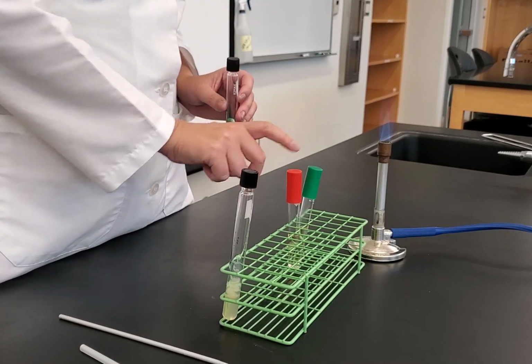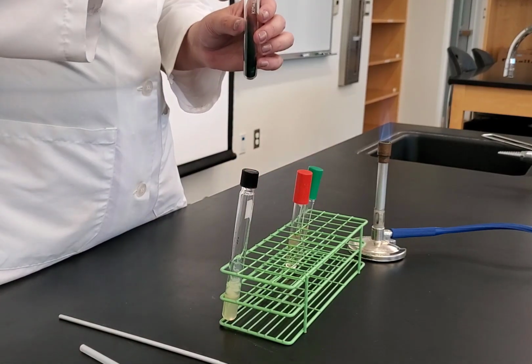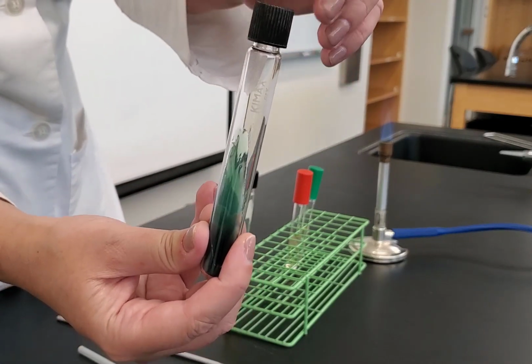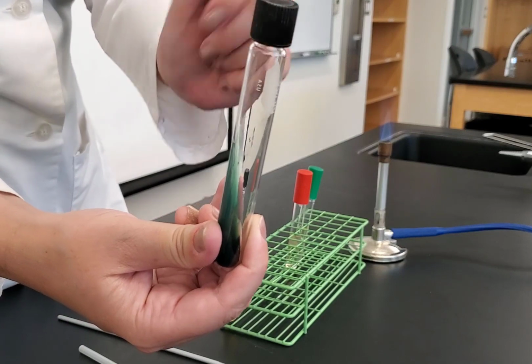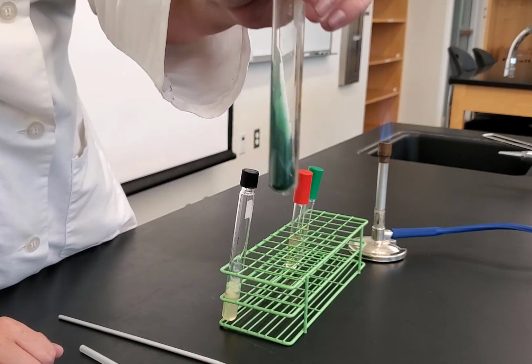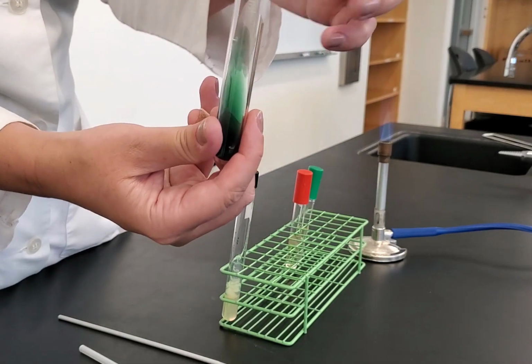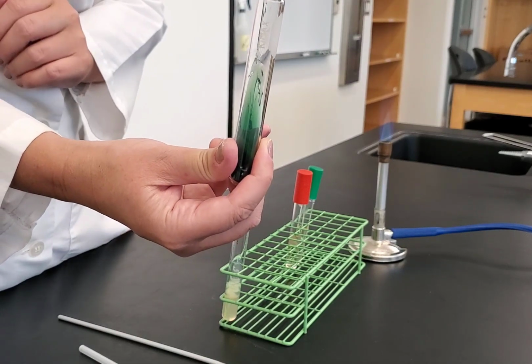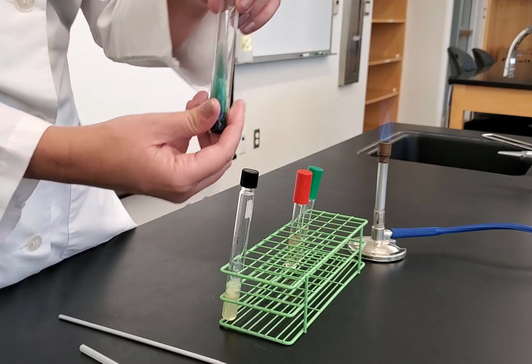Now, notice for my indole and my MRVP, these are loose caps. The citrate, though, this is a screw top cap. So the way that we put these lids on really matters for the screw tops. I can't have it all the way tight. If I do that and air can't get in, then there's no way I'm going to see any growth. That's going to affect my result. So you have to make sure that when you use these screw tops, what I do is I put the lid on all the way, and then I give it about a half turn loose. You want it to be able to wiggle, but not to fall off. So you want your cap loose. It's not going to fall off, but air can still get in.